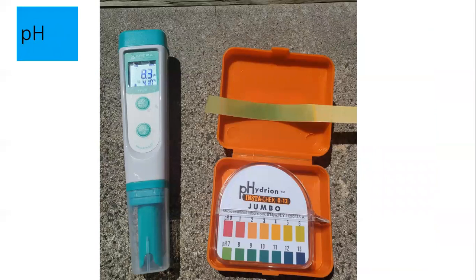Our next measurement is pH. So this one is looking at how acidic or how basic or alkaline the water is.